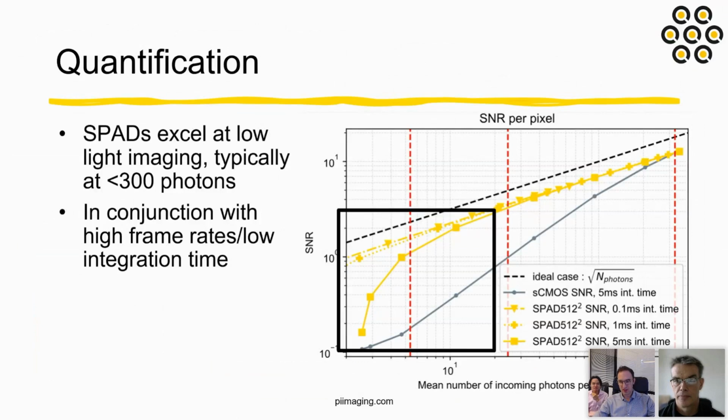The pixel pitch is 16 micrometers. And then we have 2 options. Either we can have microlenses, in which case of course the sensitive area is 16 micrometers. Without the microlenses it is 6.5. And what about the other 2 detectors that you offer? The other 2 are 23.5 and 29 micrometers.